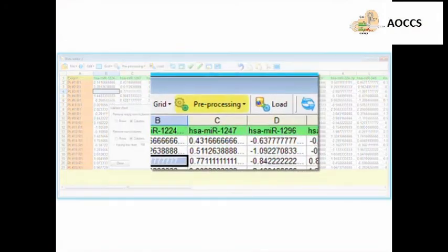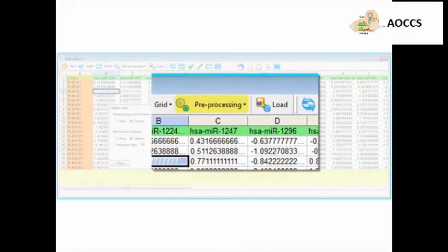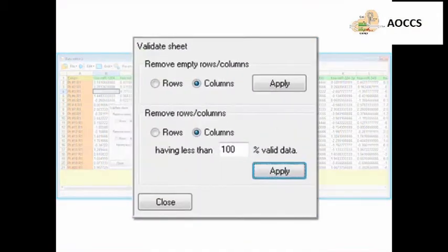Remove empty and almost empty columns by opening the preprocessing window and selecting Validate Sheet, and then selecting Apply on the Remove Empty Columns line. In the line below, choose the desired percentage of valid data and click Apply. Select 100% if you wish to compare only microRNAs common to all samples.